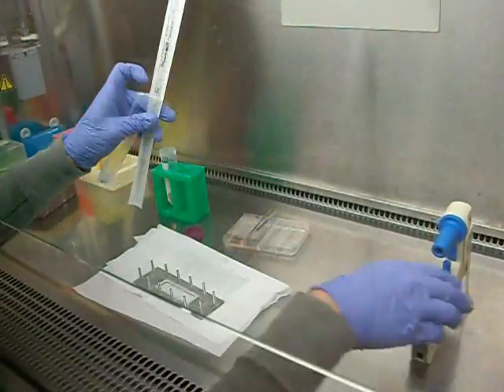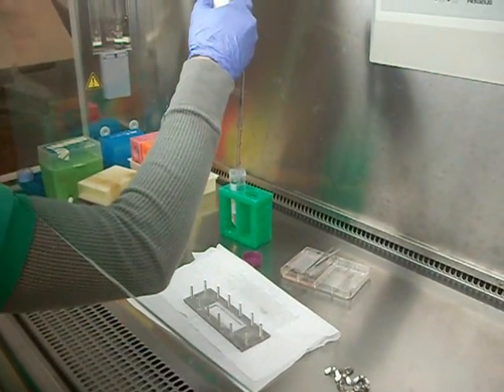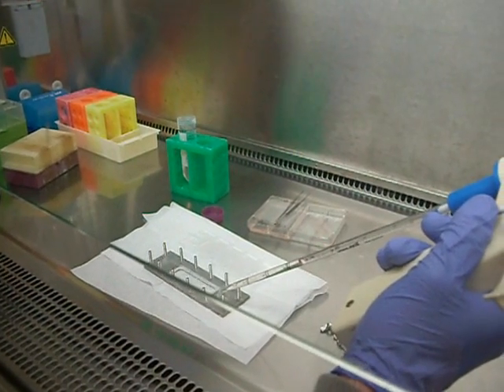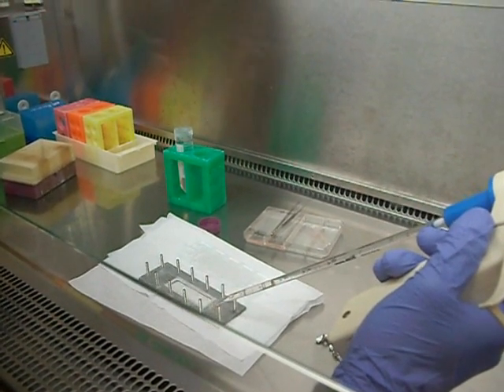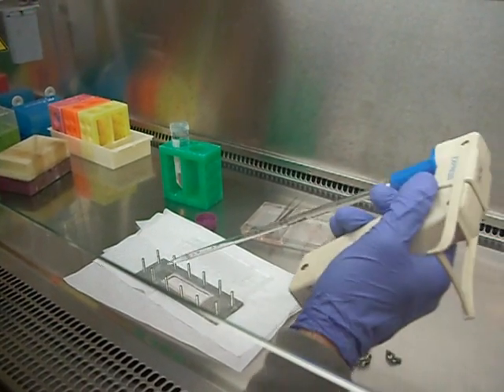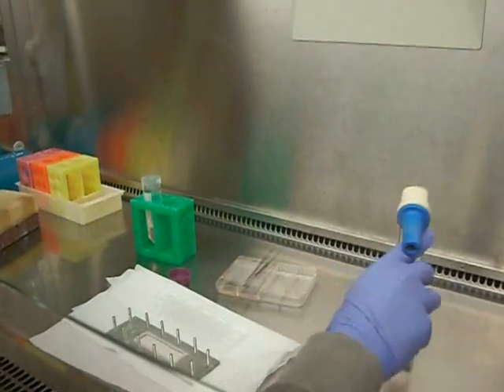Now that the gasket's on there, we need to go ahead and quickly add some media to the top of those cells. You want to do all this somewhat fast so that your cells don't dry out. Notice that I'm not adding the media directly to the top surface of the cells. I'm adding about 4 mils. That's more than enough.